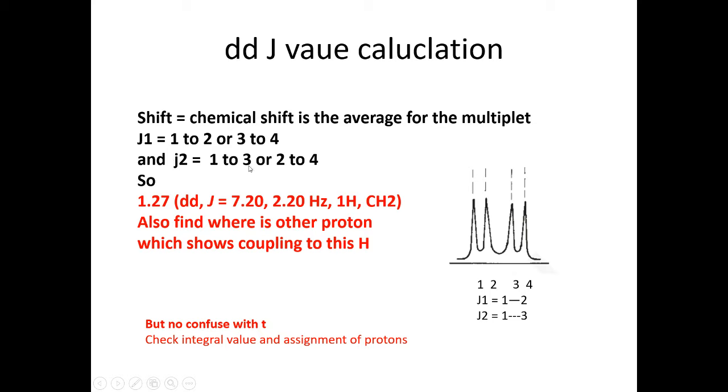The small J is here or here, and the large is 1 to 3 or 2 to 4. One should also find out where is the other proton in the spectra which shows coupling to this proton.